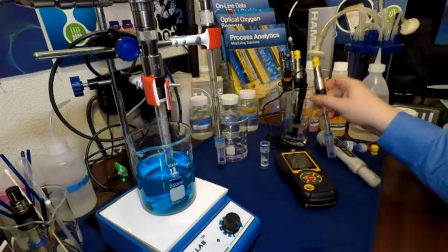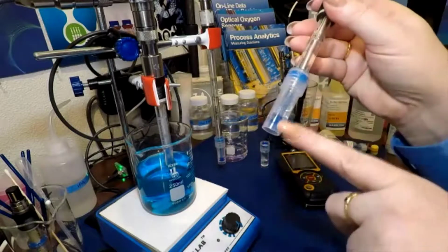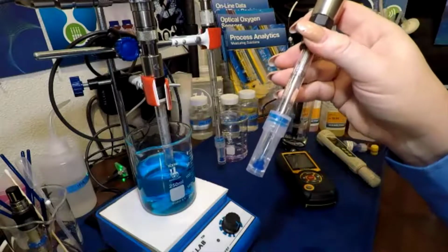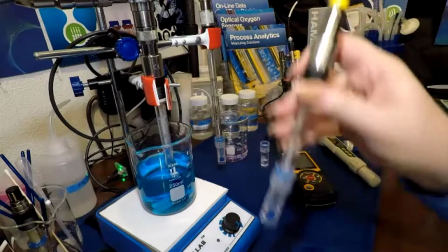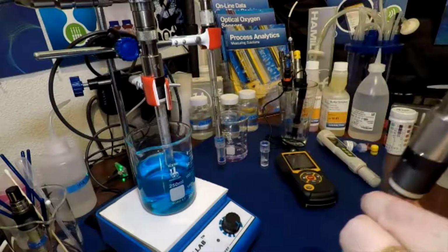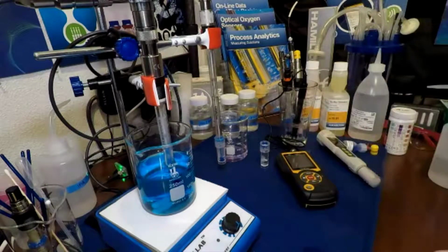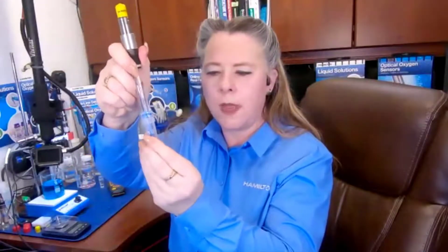If that glass is resting on the bottom, it does things to the gel layer. It deforms it. And if that outer gel layer gets deformed, then you can get errors in measurement. So again, you always want your probe suspended by liquid on all sides, not resting that bulb. Storage in conical tubes where it's resting is not a good choice because that causes deformation.